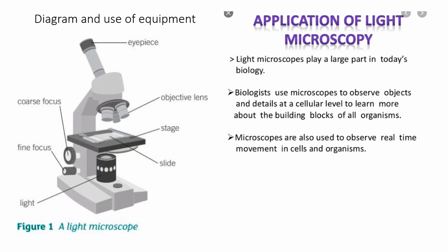So we need to know a little bit about the history of microscopes. However, more importantly, really importantly, we need to think about the wider role that they play in biology and microbiology and how we use them to learn about cells. Okay.